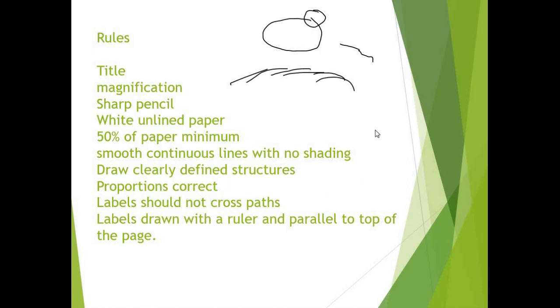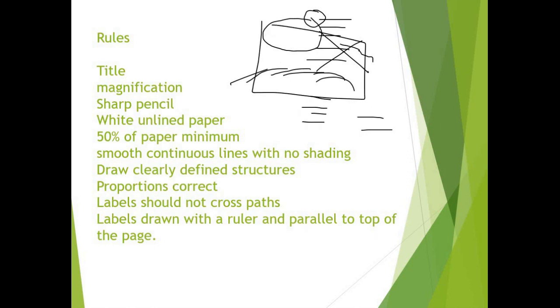And the labels should all be stacked along the side on top of each other is the best way to do it. And you shouldn't be crossing the labels over on top of each other. Okay, and they should be parallel to the top of the page. So if this is our page, they should be parallel to that top of that page.